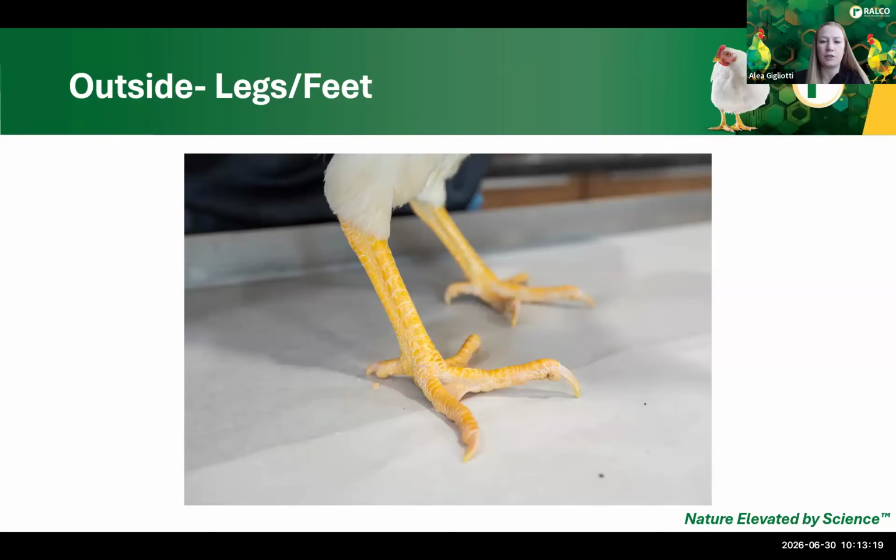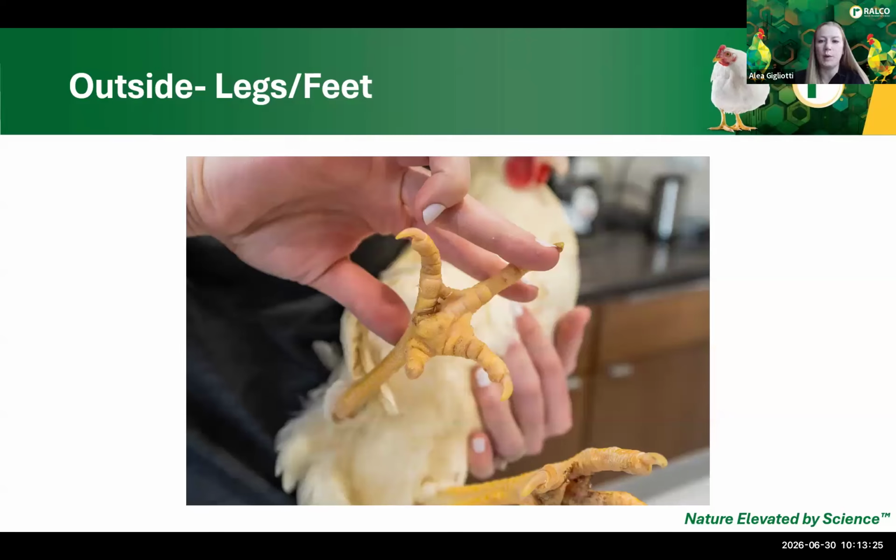And then you can also just take a look at the bottom of the feet. And that's going to show you a couple of things. Think, are there any lesions present, or is there any swelling on the bottom of the feet? Making sure that you have the proper environmental conditions for good foot pad health is really important, because at the end of the day, birds may not move around or be as active if they're uncomfortable moving around. If they have inflammation or lesions on a foot, it's tough for them to get around. It doesn't feel great. And so they may be less motivated to go to the feeder or go to that nipple to drink if they have something going on on the bottom of their feet.